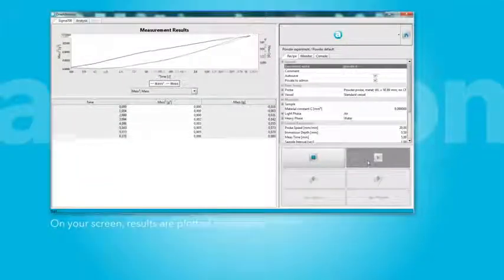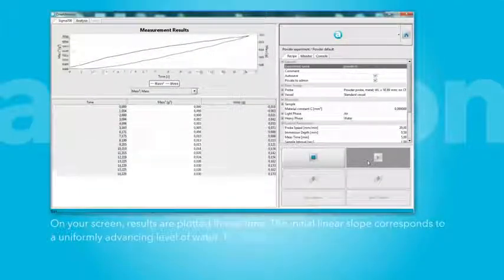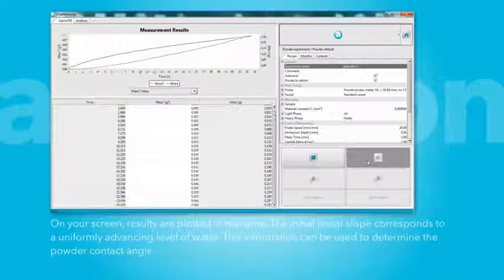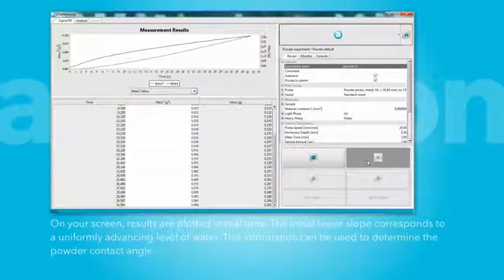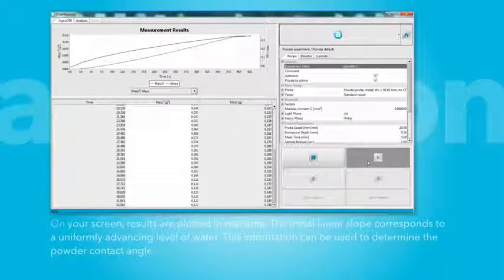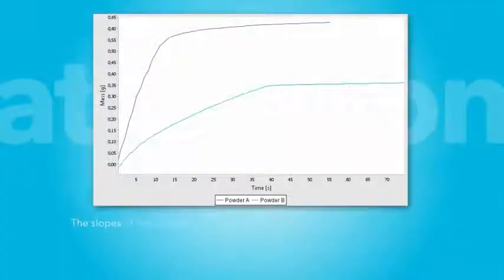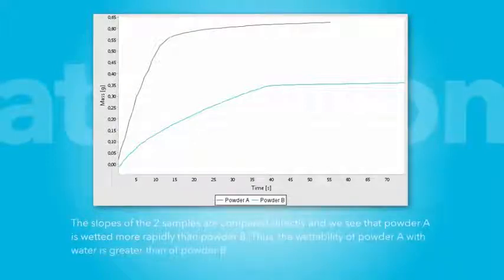Results are plotted in real time on your screen. Initial linear slope corresponds to a uniformly advancing level of water. This information can be used to determine the contact angle. The slopes of the two samples are compared directly, and we see that powder A is wetted more rapidly than powder B. Thus, the wettability of powder A with water is greater than of powder B.